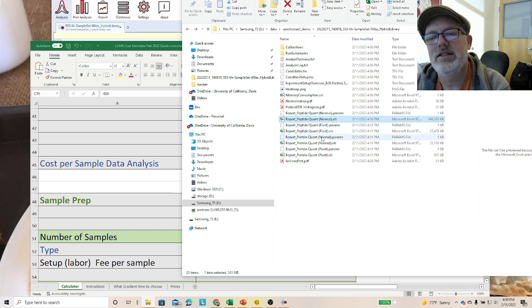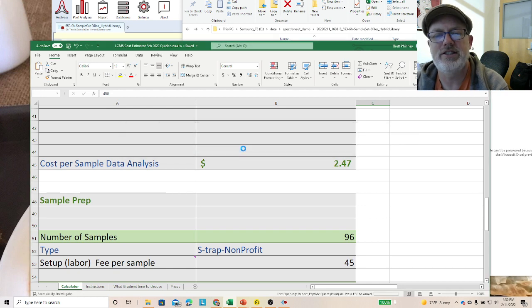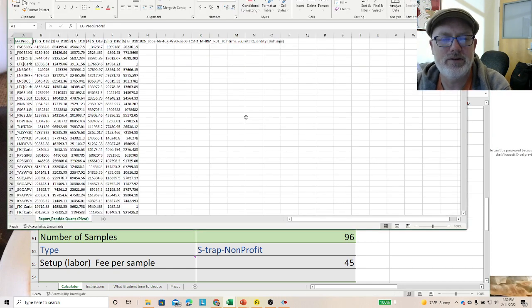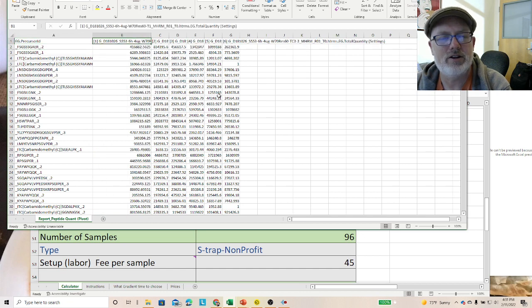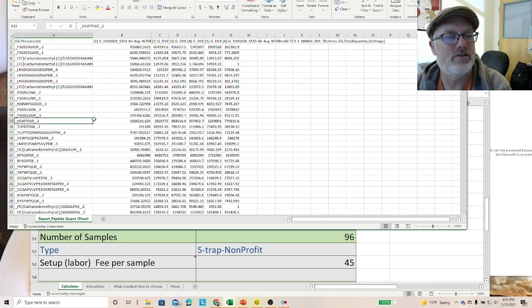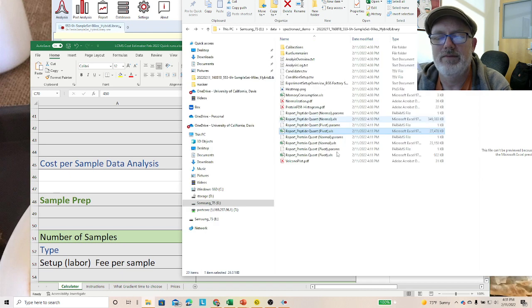There is the peptide quant pivot. So this will be the wide format. If you guys are familiar with R, that'll be a long format. This will be a wide format. So it's basically a real simple one, peptide on each line with each column being the quantities across all 6 of the runs in these experiments. So if you're interested in one peptide, you can see how its quantity has changed in each experiment. Remember, these are unitless quantities. So they don't really have any units, but you can use them across the rows.